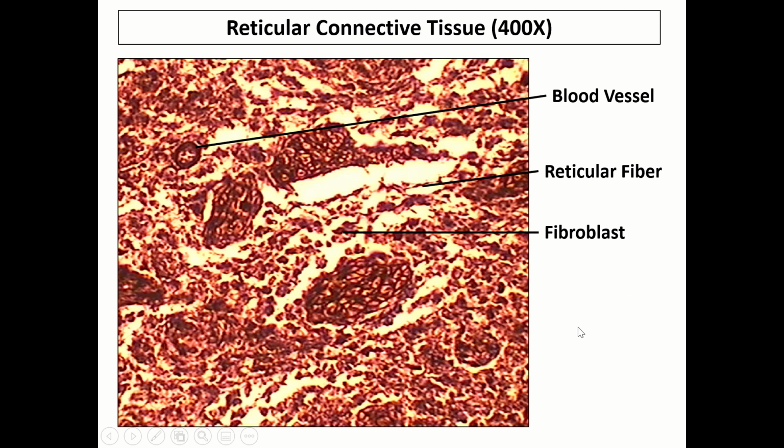Reticular connective tissue here is going to be highlighted by the presence of dark black reticular fibers. If you look through the slide, you'll see that it looks like there are spikes that run from the surfaces of the cells all throughout the tissue. And those are the reticular fibers which weave all throughout the organ itself. Again, providing a really strong framework to build a fibrous organ and to allow blood vessels to pass through without being damaged when that organ moves.